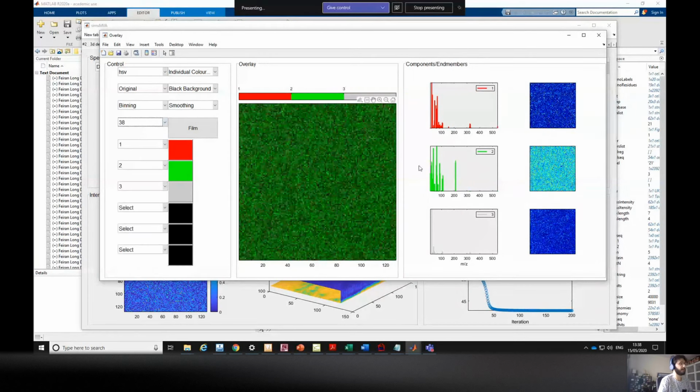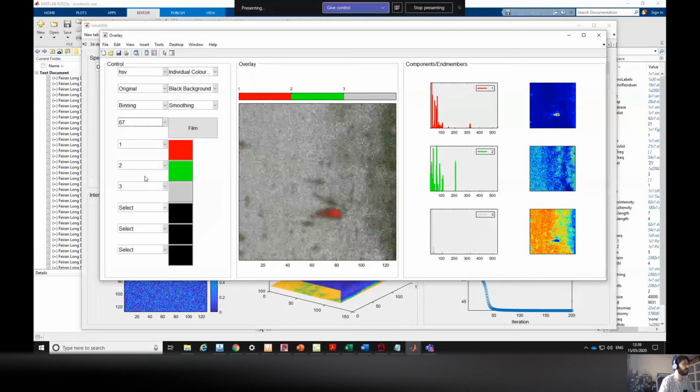And before you had the green. This film button will create, not planning to cover this today, but just to let you know, a video going level by level at a specific frame rate that you set. So sometimes it's useful as well for presentations, because you show a kind of video of your data, especially in this case here when you reach this level.